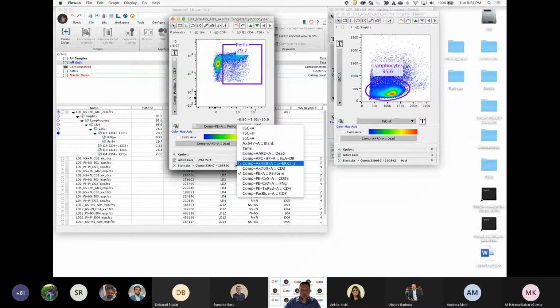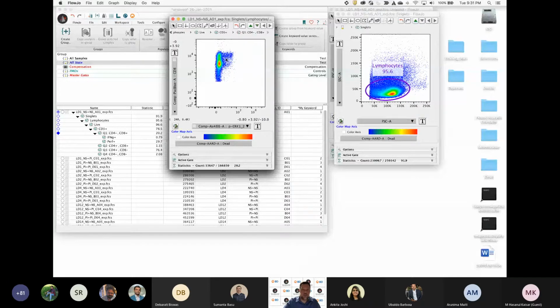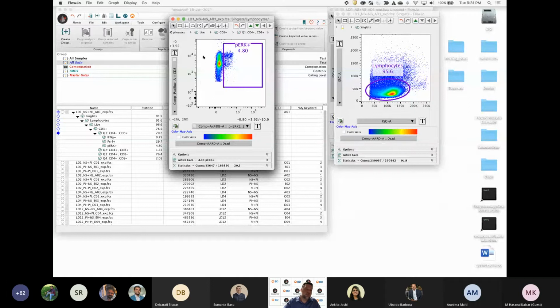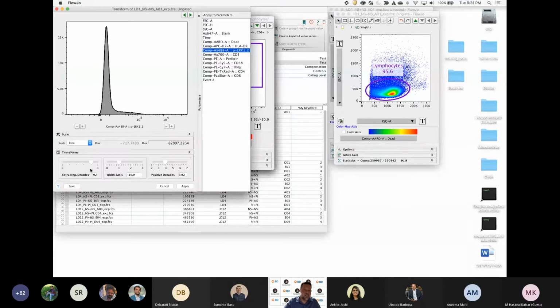And then I'll look at my phospho-ERK marker. Right? So this is phosphorylation of the extracellular signal regulated kinase, and we'll see this go up in our stimulated conditions as well. p-ERK positive. So there's my 3 markers. I notice that there's a lot of white space when I'm gating here, and I can probably spread this distribution out better by going to my Customize Axis button, removing the extra negative decade space that I have in there, and then I don't need to do that 3 times.